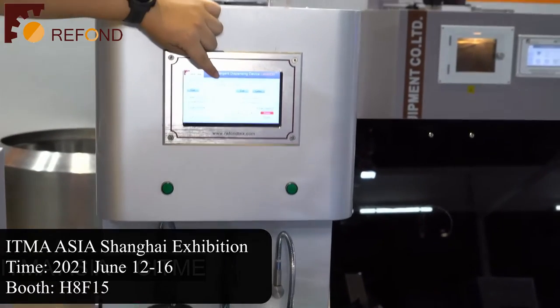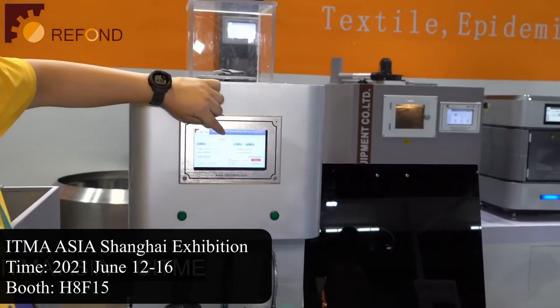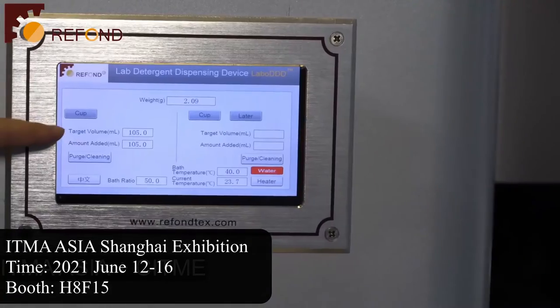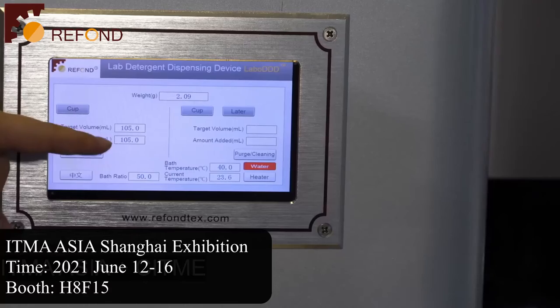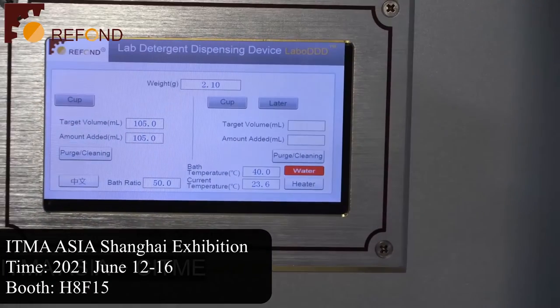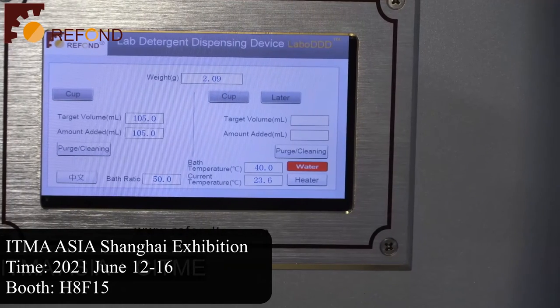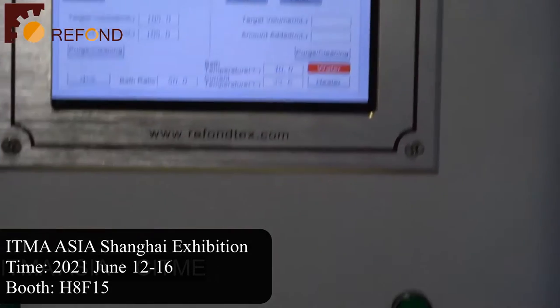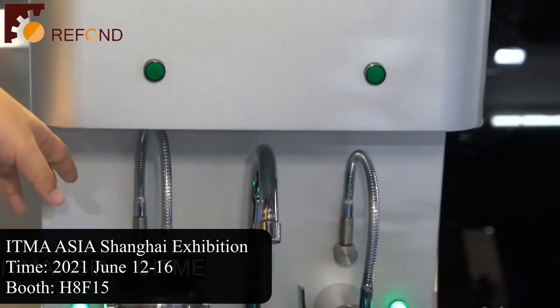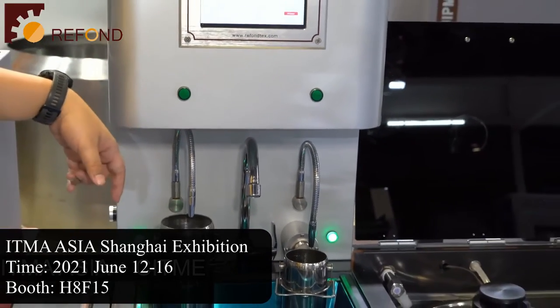The weight of the fabric is measured to 0.01 gram resolution. The amount of detergent to be pumped is controlled to 0.1 milliliter resolution. The filling procedure for one specimen and one test container is about 15 seconds, which greatly reduces the human effort involved in this process compared to the more traditional method.